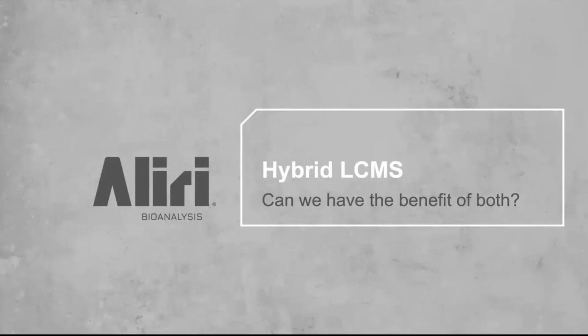So then you can use a non-specific antibody that binds perhaps both the native and therapeutic peptides. There are a lot of different names out there for this type of a process where you begin incorporating LBA elements into the LC-MS workflow. We preferred the hybrid LC-MS name. However, it's also been called immunocapture, immunoprecipitation, or immunoaffinity.